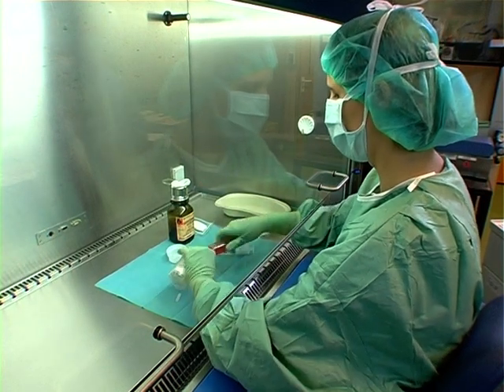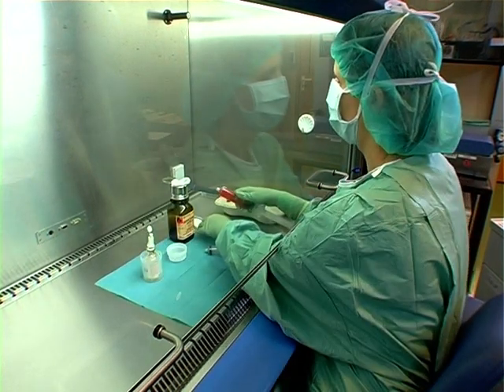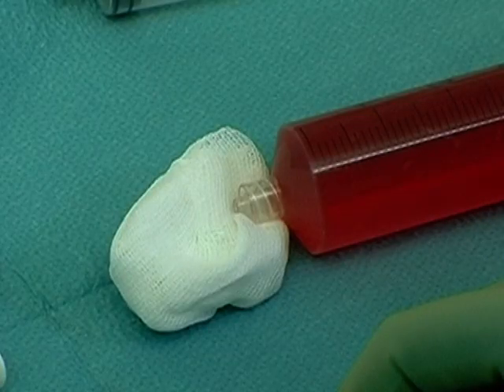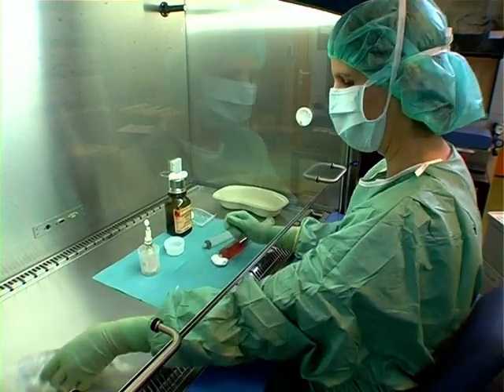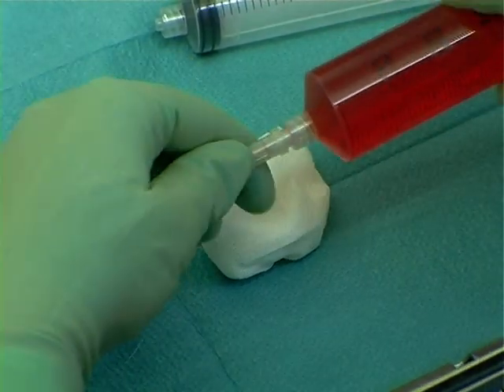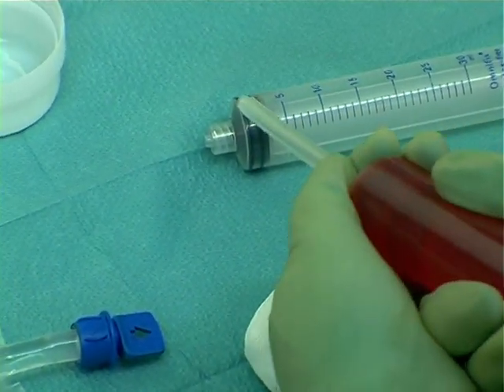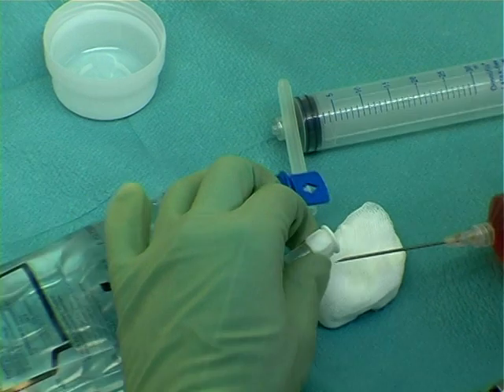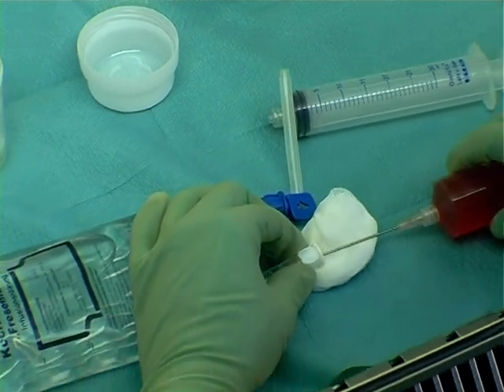Disconnecting the syringe. Fitting the needle. In order to prevent contamination caused by droplets or aerosols, compresses or swabs must be used. Injection.